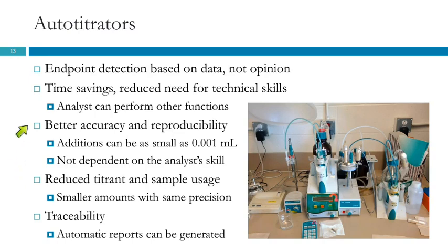Another advantage to this is your accuracy, your reproducibility. It's not dependent on the analyst's skill. If you have the same person doing all the samples every day, day in and day out, maybe that's not an issue, but that's probably not going to be the case, right? You're probably going to be having a couple of different people working on something like that over the course of weeks or months. And this way, the results are going to be consistent regardless of who's operating the instrument.